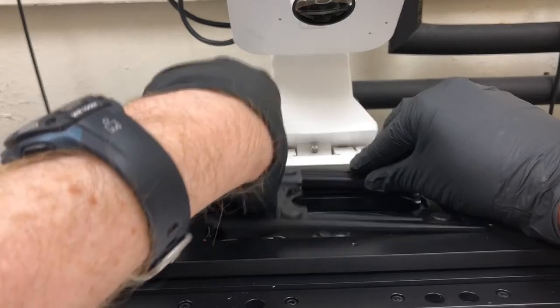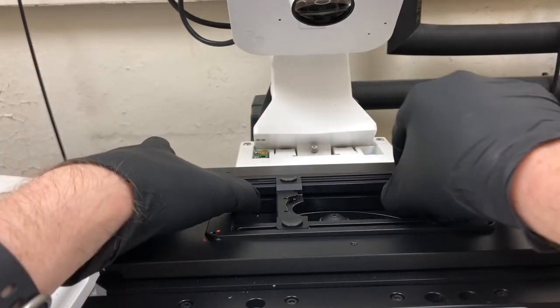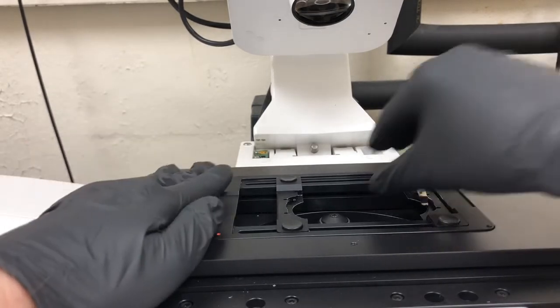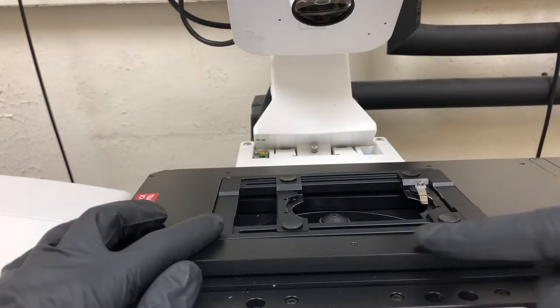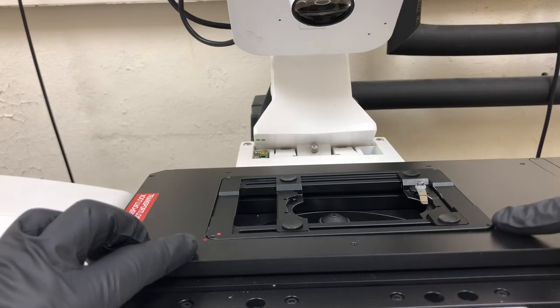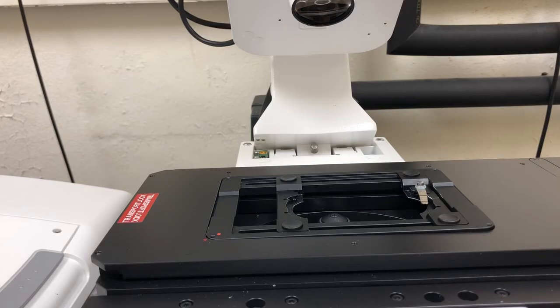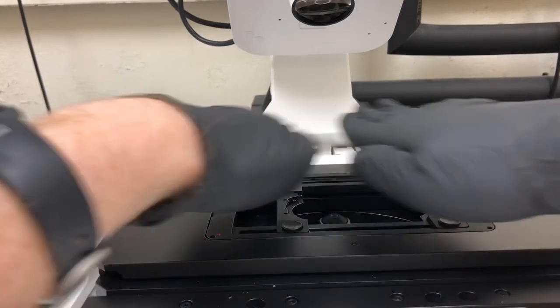I don't want something like this where it's wobbling. I also don't want something like this — you can see that it's flat here but as you move to the right it's lifted up. You don't want that because that will tilt your sample and cause all sorts of problems with the imaging.